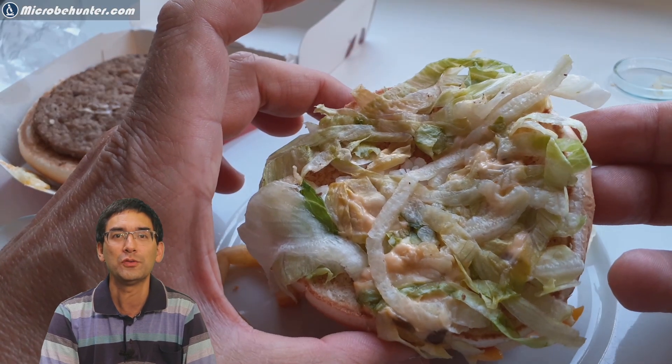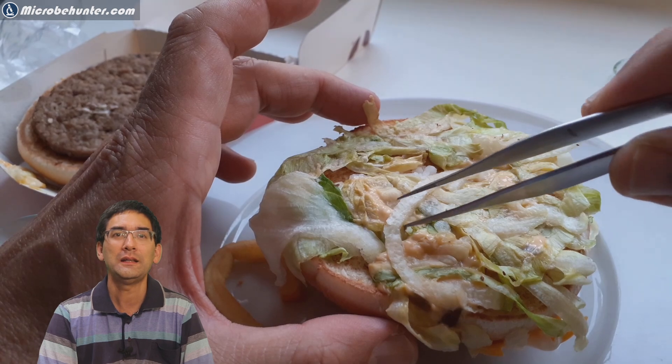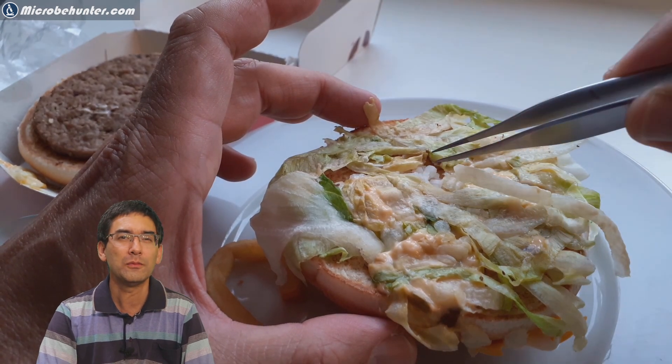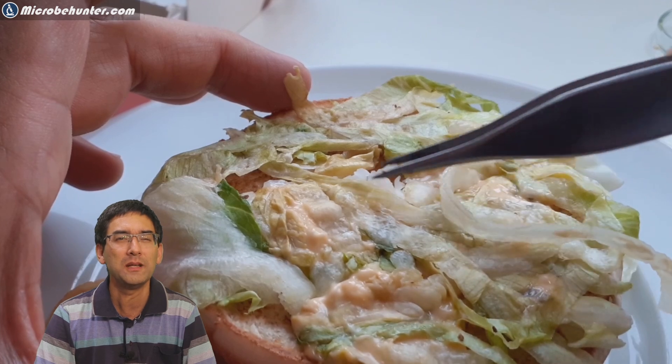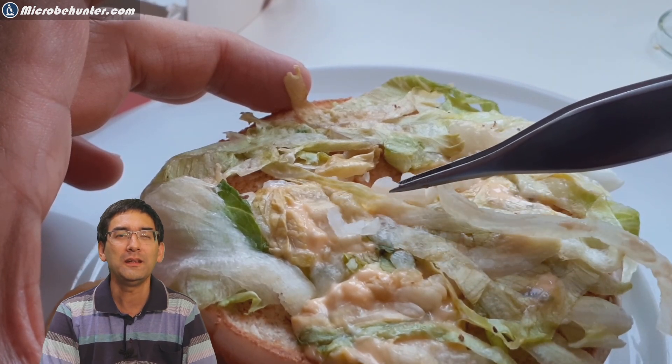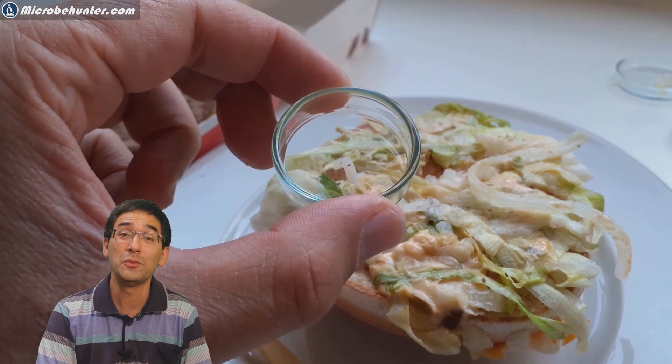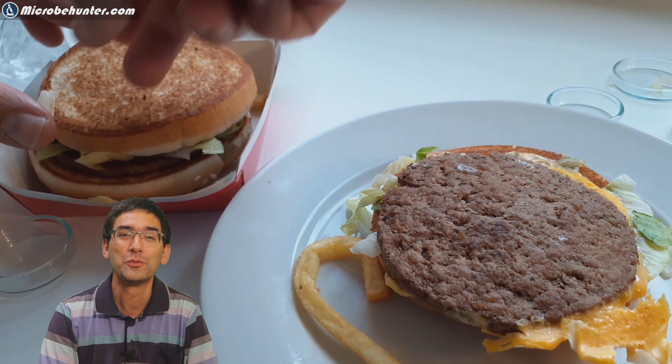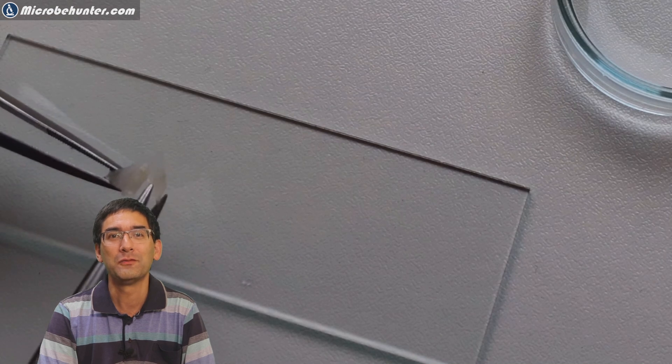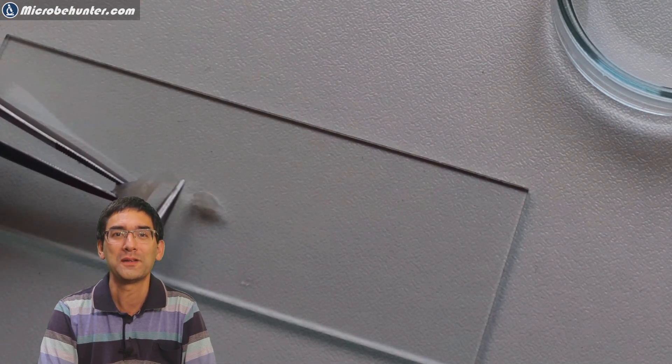Let's flip the meat over and continue our search for some interesting parts in the hamburger. I did find something - some white cube-shaped little structures. At the beginning I didn't know what they are, but I think these are onions. That's an easy one - onions are quite easily observable, so I put a piece of onion under the microscope as well.